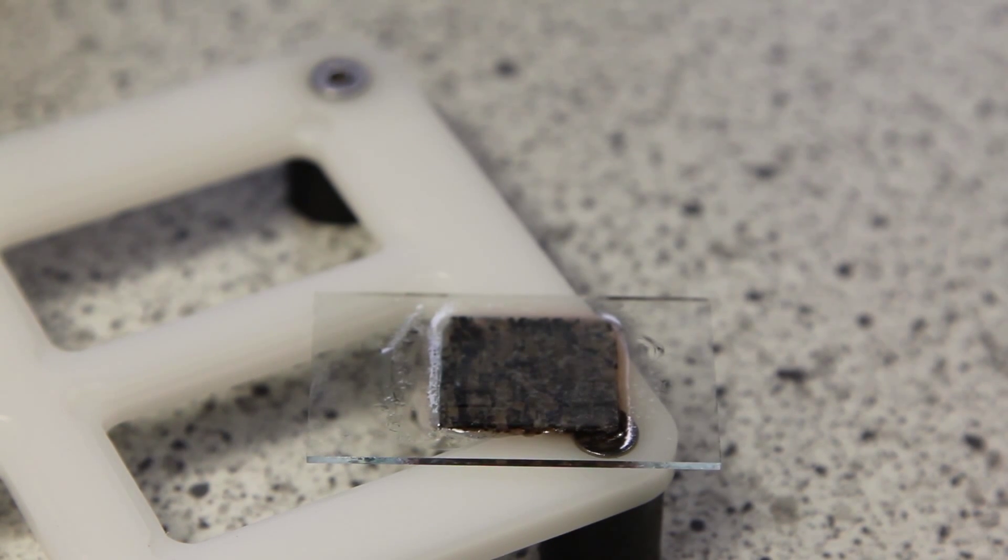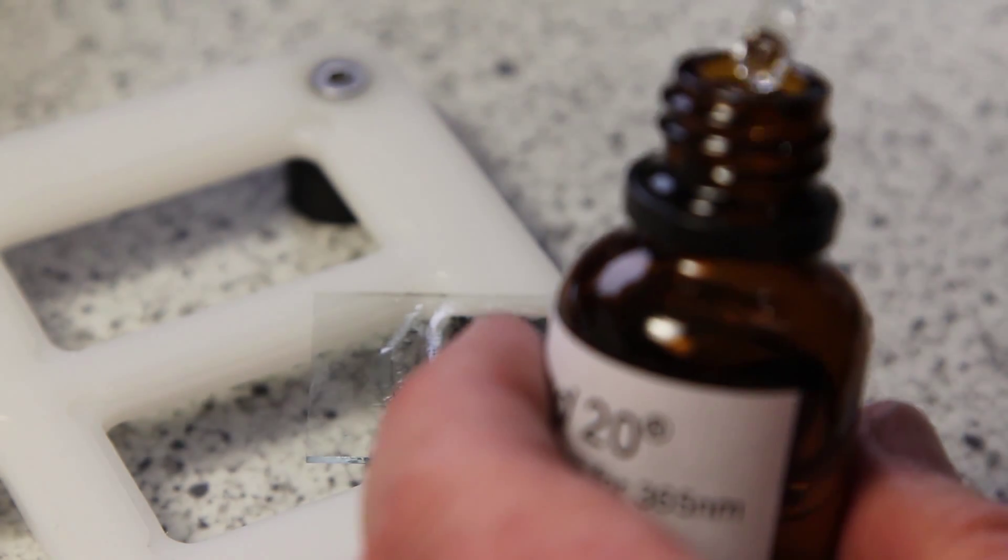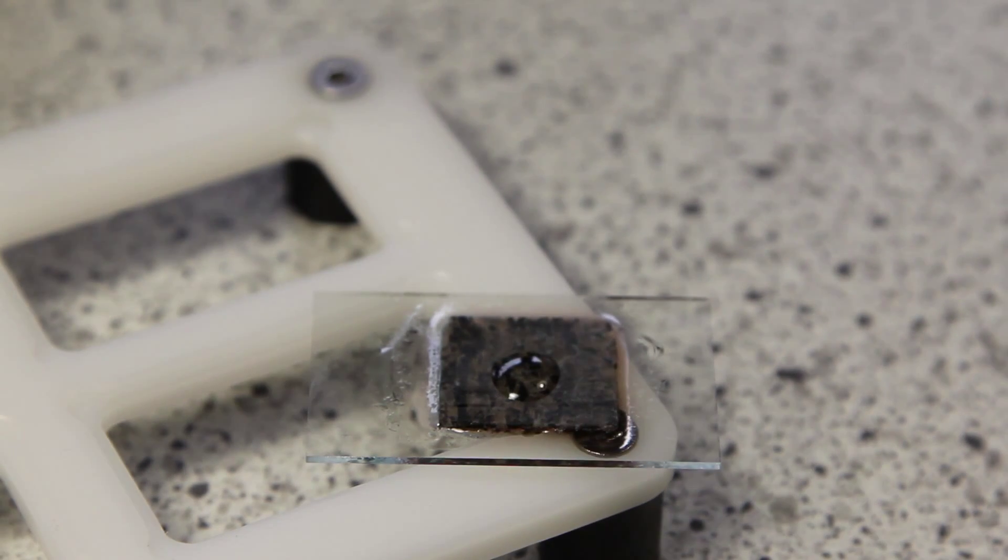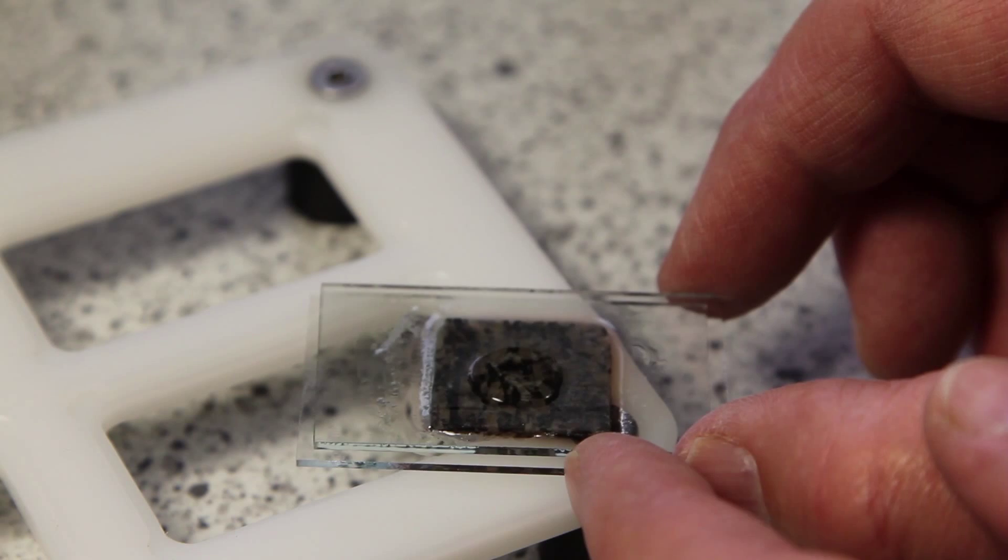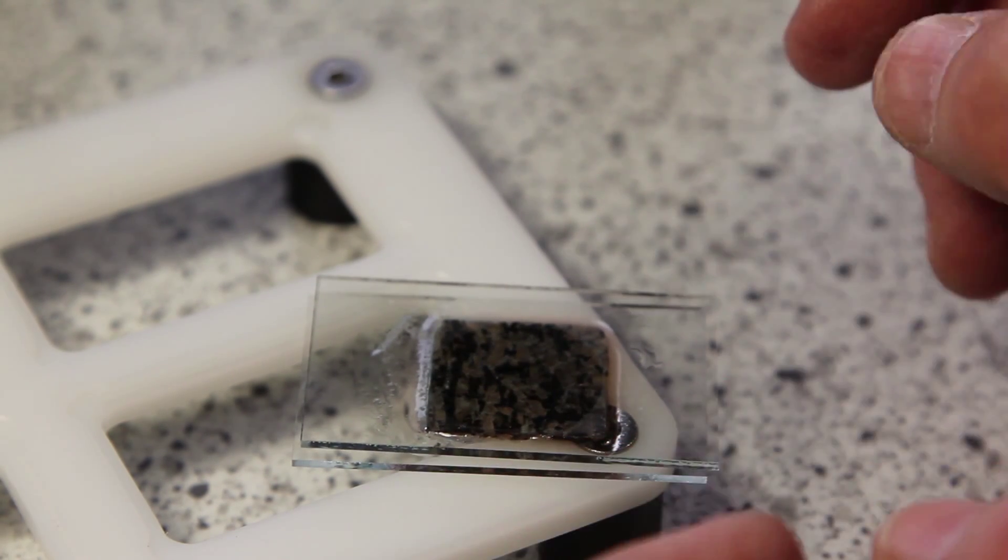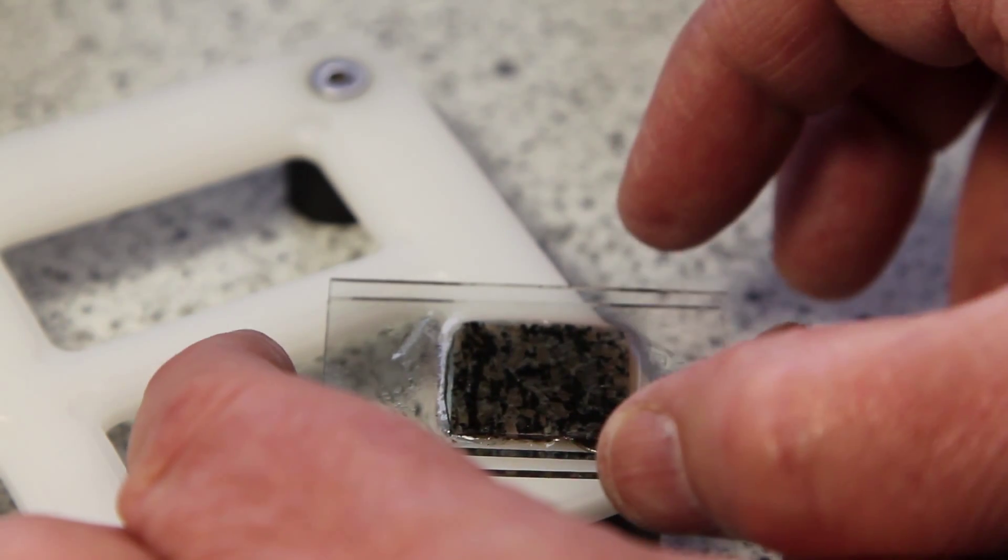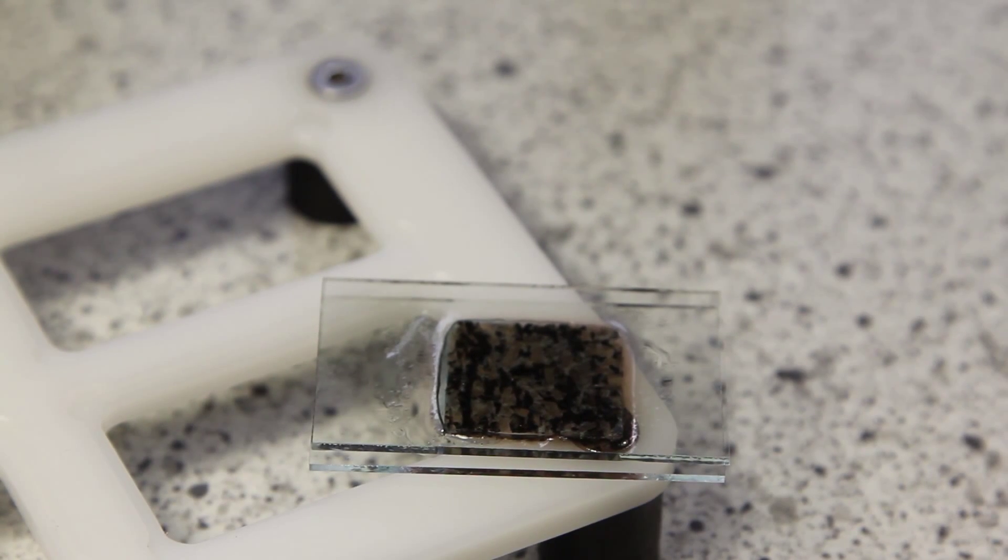Now I apply a drop of EpoSpeed 20 onto the sample and I put a cleaned slide on the sample. Carefully, do not include air. I watch if there is not any air on the glass.